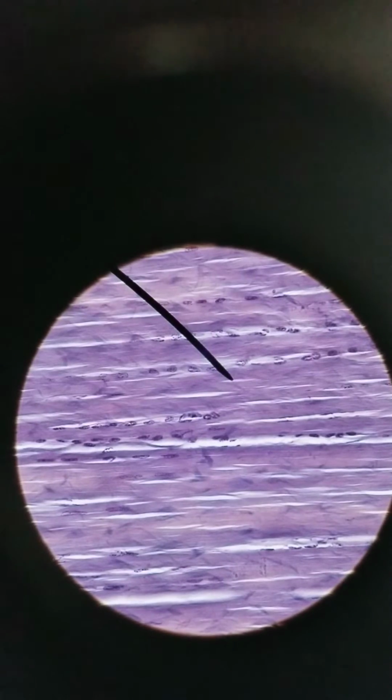Let me change the focus a little bit. There we go. But you can see that these fibers are all going in one direction. Right now it's horizontal. These fibers are very tightly packed close together. The white space that you see, that's just because of shearing that happened during the cutting process of creating this tissue sample. But this is a dense, regular connective tissue. Dense, regular. It's white and fibrous, so it's also called white fibrous tissue. But dense, regular, it's very, very strong, especially in this one direction that you see. This, in this case, horizontal.